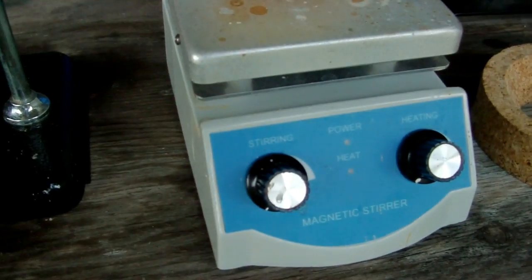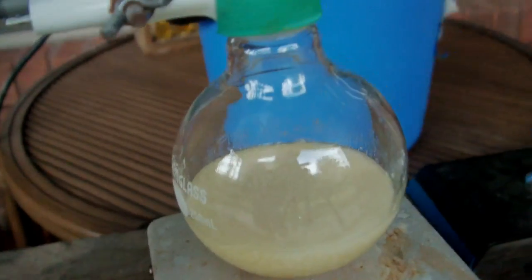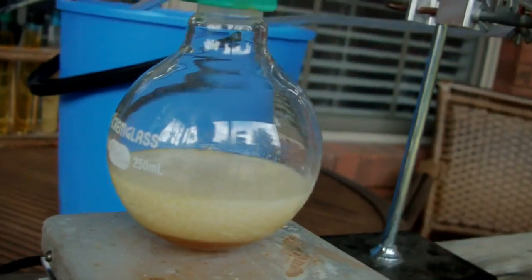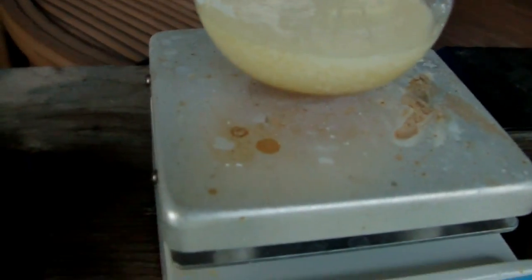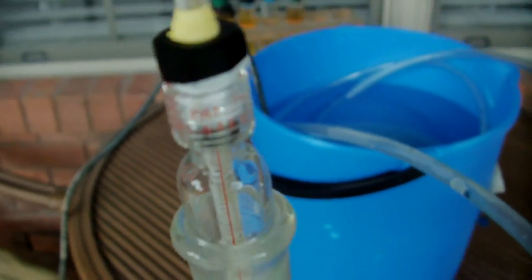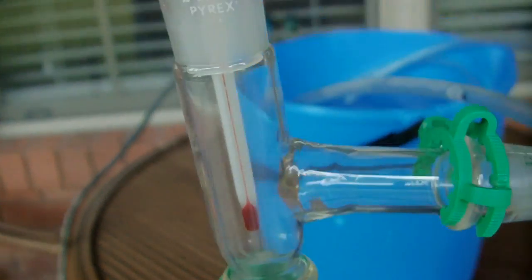It's just a standard, simple distillation. You've got your heat source, your reaction flask, which you can see the sulfuric acid has settled to the bottom, or the ammonium nitrate has floated to the top. This goes up into the still head, which is connected to a thermometer adapter, so I can monitor the temperature of the vapors.